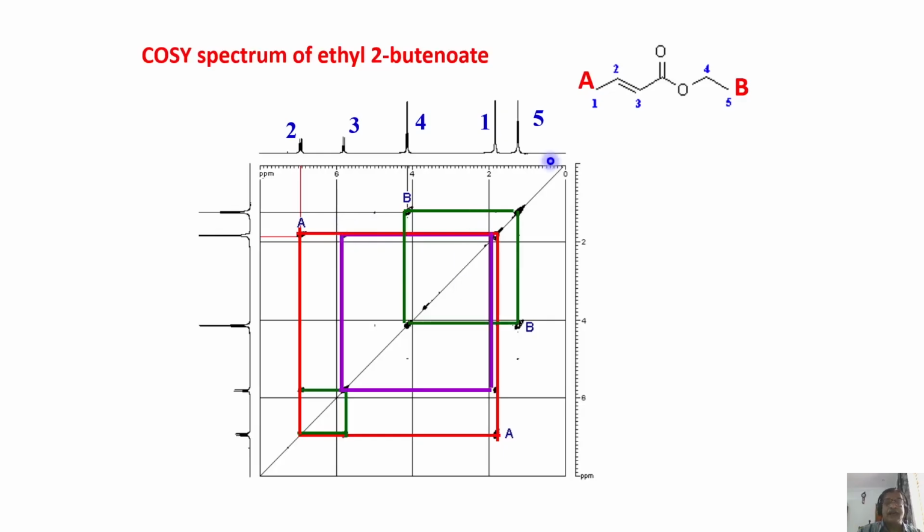Now you see the cross peak between 3 and 1. So 1 has a coupling to both 2 and 3. It formed one coupled spin system. Interestingly, we saw long range correlation in this COSY spectrum. And this is another spin system where we got correlation to only 2 coupled partners. I hope you understood how we can interpret the COSY spectrum.